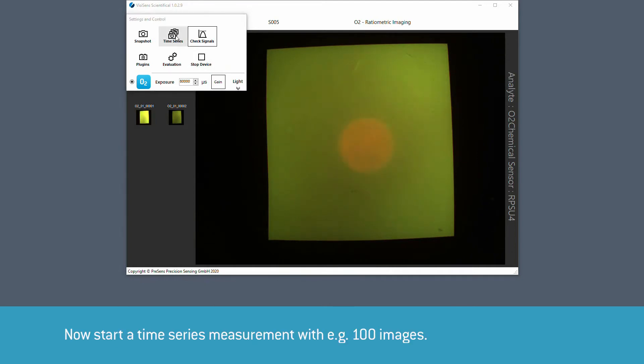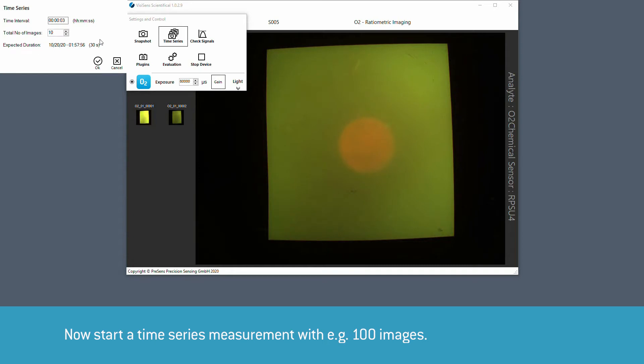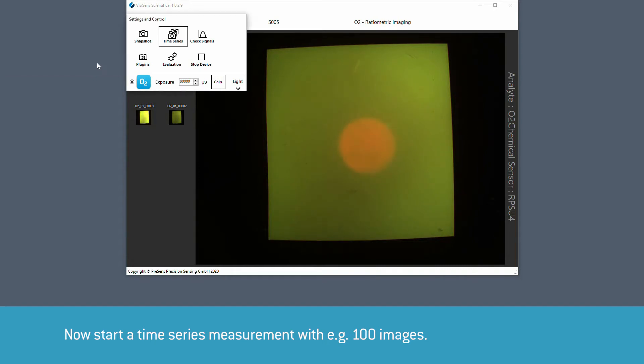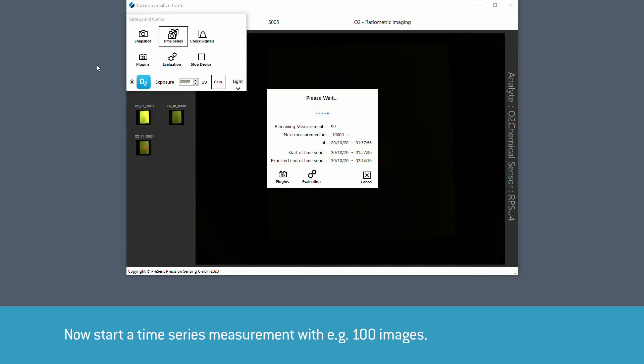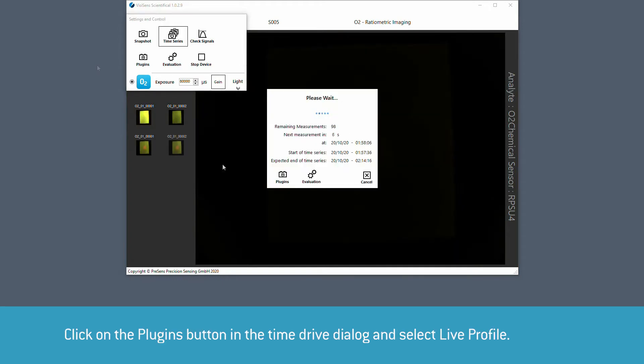Now start a time series with for example 100 images. Click on the plugins button in the time drive dialog and select live profile.